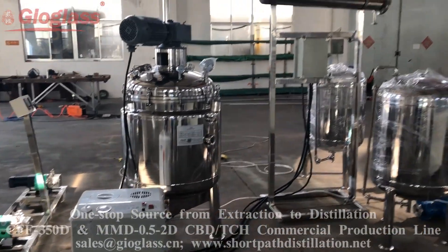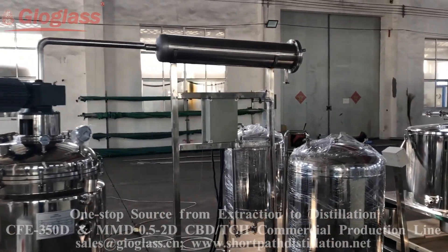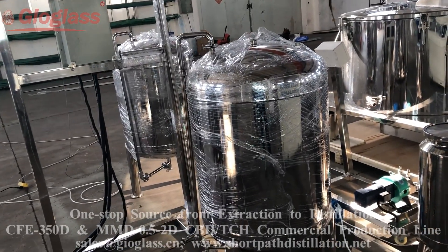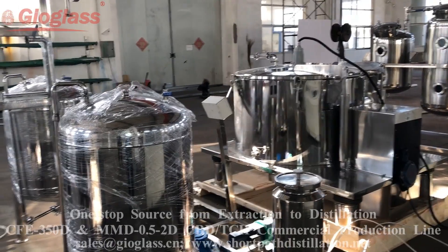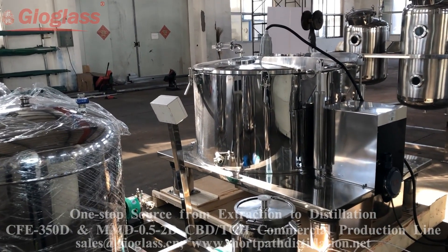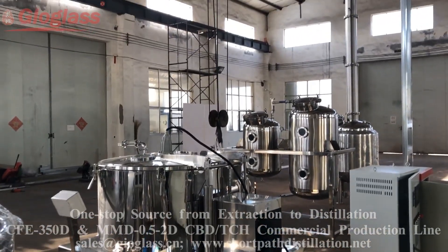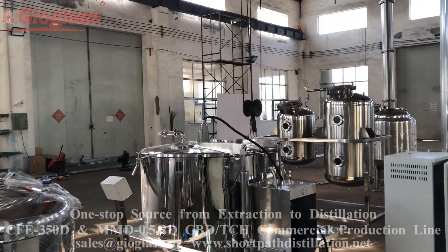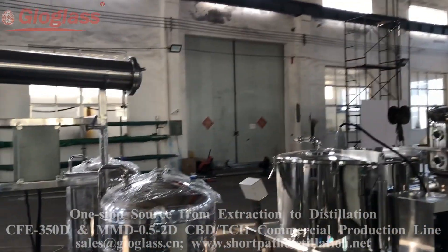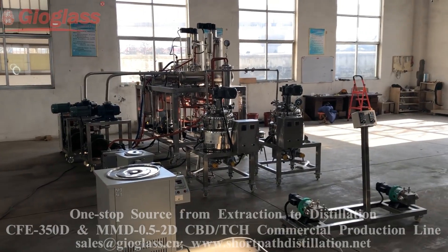The ethanol will be collected into these two tanks, then pumped back to the centrifuge extractor. This is the continuous production and ethanol regeneration process.